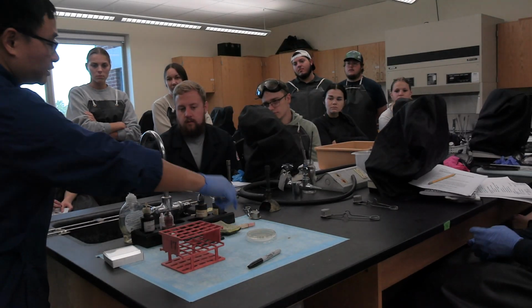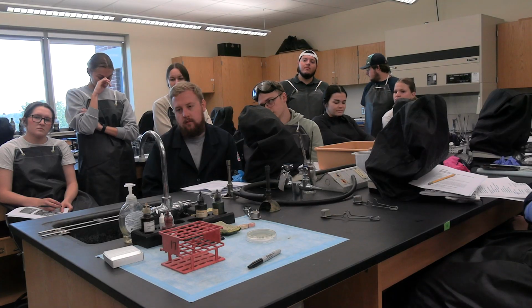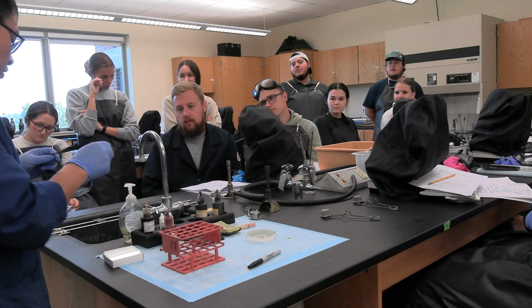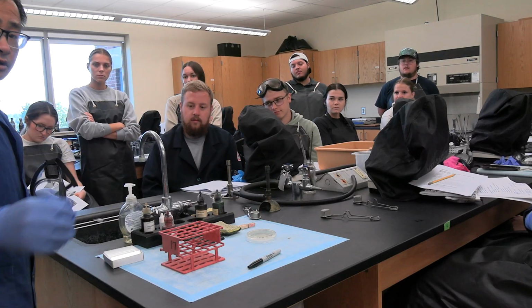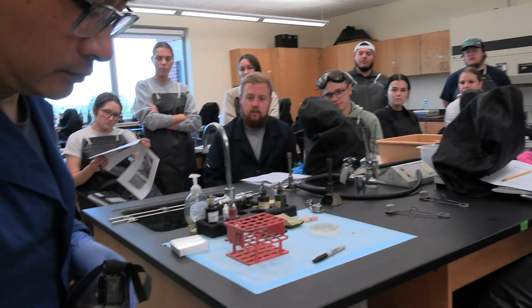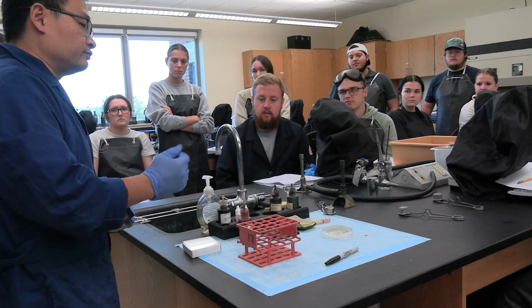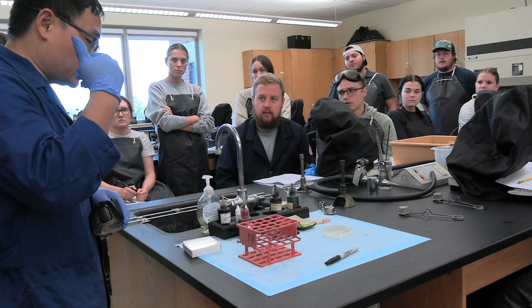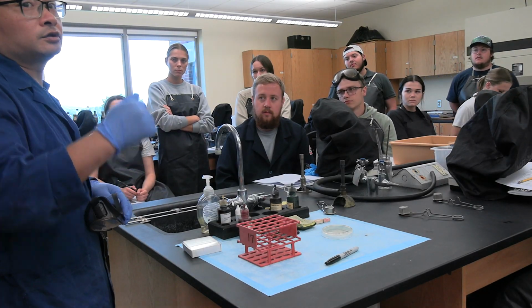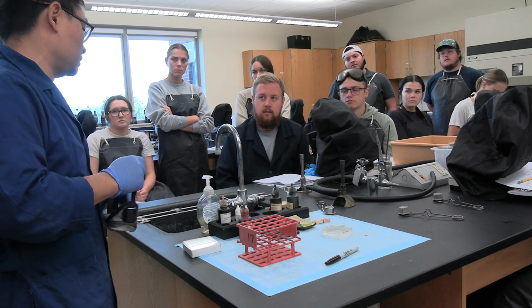A very important step we need to emphasize. At this moment, you need to wear goggles to protect your eyes. All these dyes, if somehow they touch your eyes, the federal regulation is to flush your eyes with water for 15 minutes.